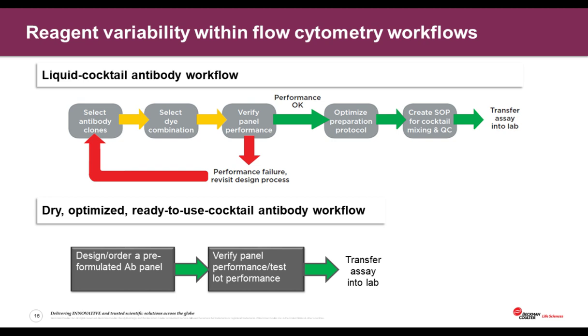There are various vendors out there that have optimized the cocktailing workflows by introducing dry and optimized ready-to-use cocktails. These cocktails are basically dried down antibody panels that have been pre-designed by experts in the field, validated and QC checked for you. So they eliminate that entire section of panel design. First and foremost, they're dried, so there's no cocktailing. So you're limiting the error of pipetting, because you still have to introduce the sample into the tube.